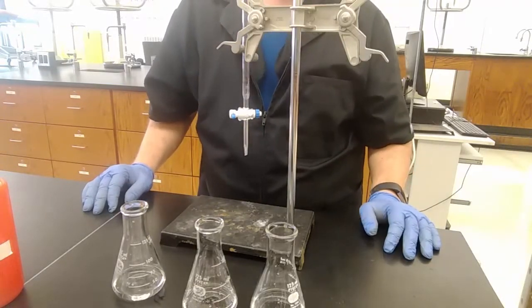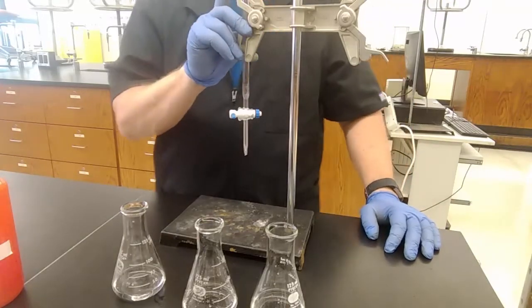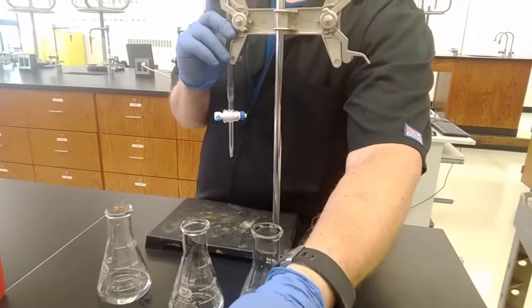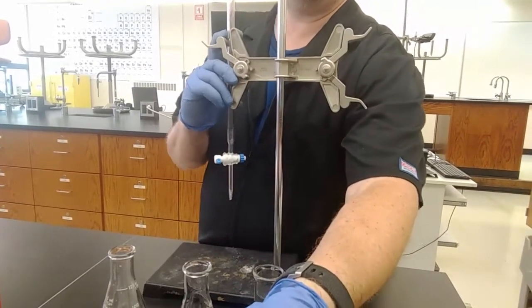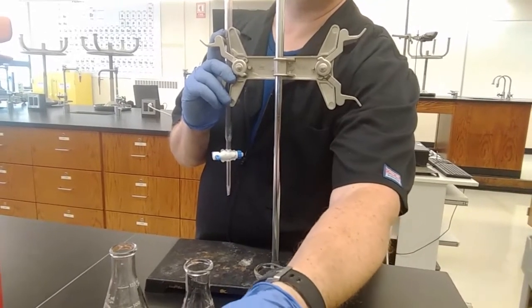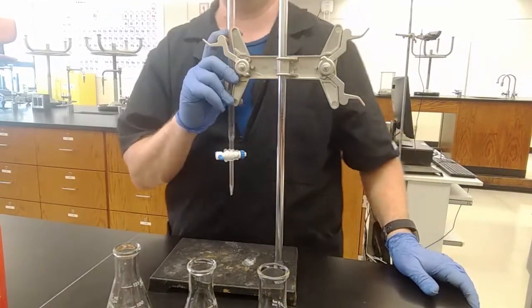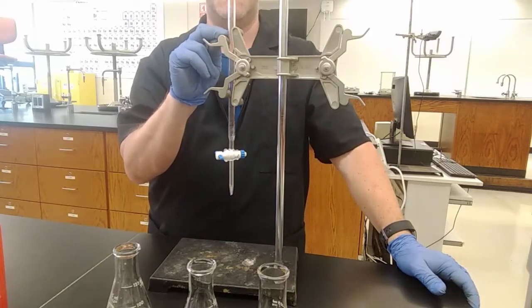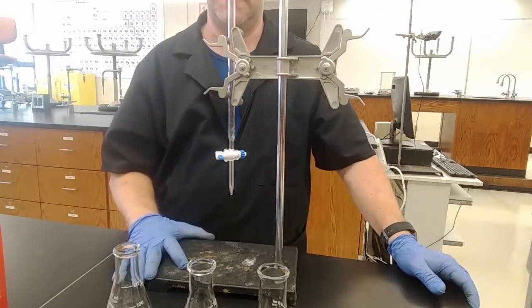because if I just write down 20.2 milliliters as my reading, then that is assuming that I have guessed the 0.2, that it was somewhere between 20 and 21, and I guessed 20.2. On here, I'll be able to tell, is it between 20.1 and 20.2, and I have to guess the hundredths place, okay?